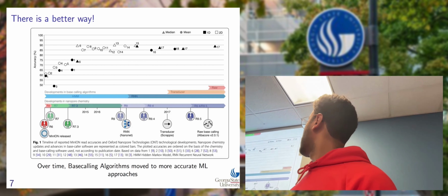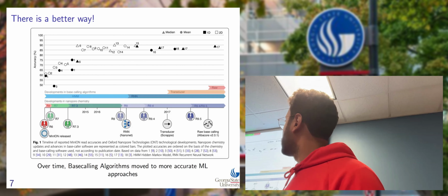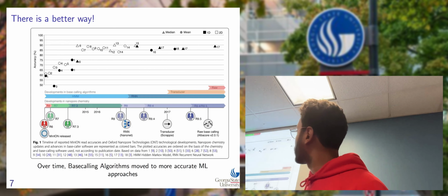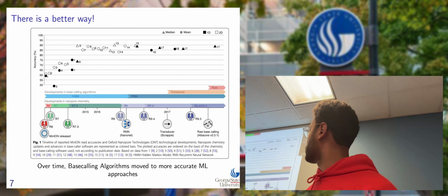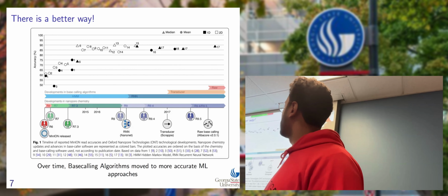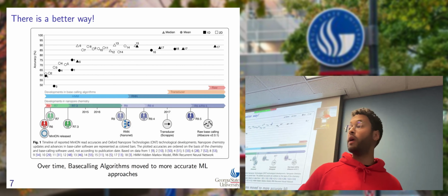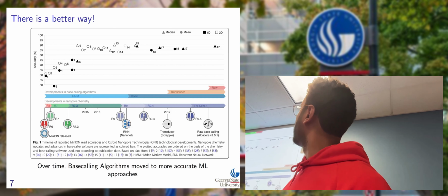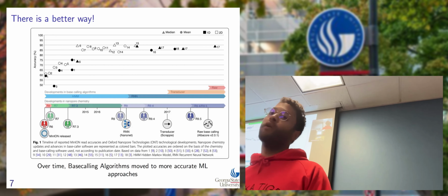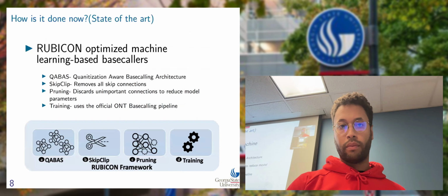But you can see over time, base callers not only progressed past the hidden Markov model, we have recurrent neural networks. I'm not sure exactly what transducer is, but my basic point here is that we moved beyond the hidden Markov model, and we are now upon the recurrent neural networks where we can have much greater simplicity by only having 1D reads or sequencing.